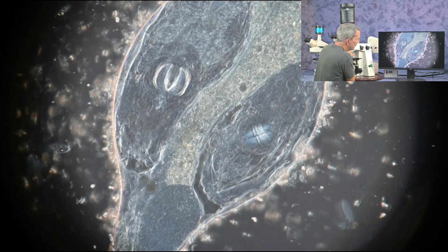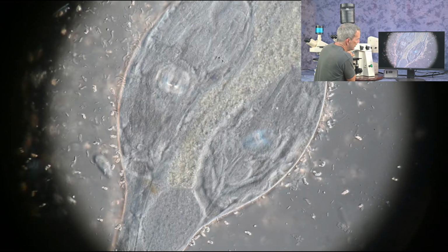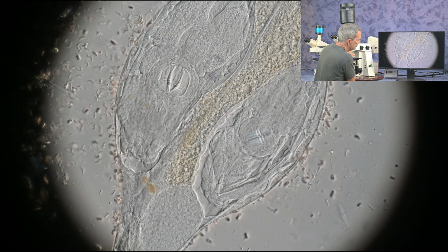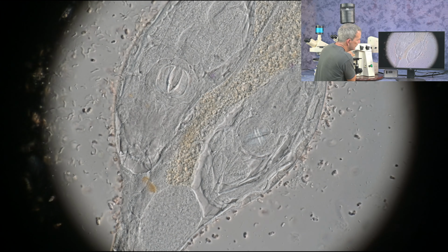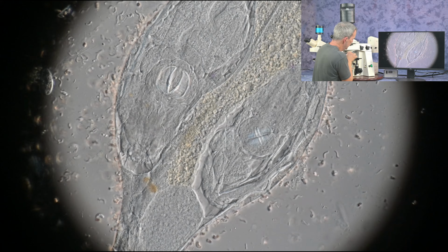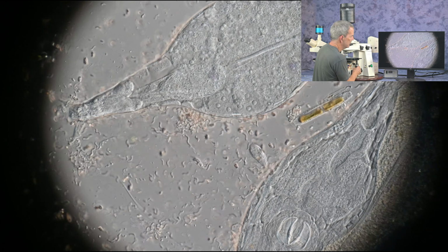Going through a pseudo dark field right in here. And let's get it to the other side and see what the contrasting looks like. Okay, let's move this around. There was quite a bit on this slide.